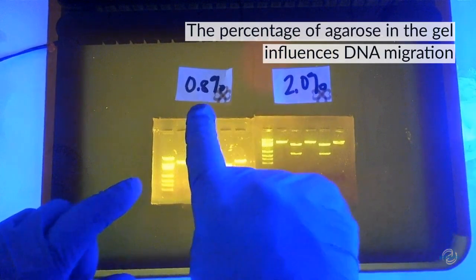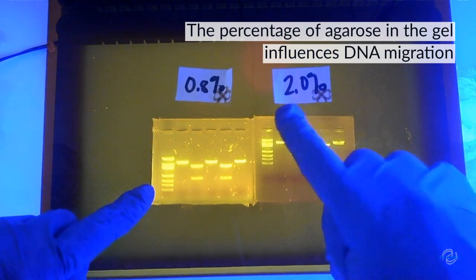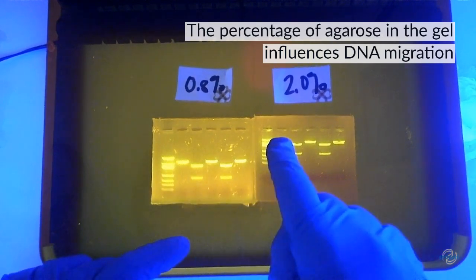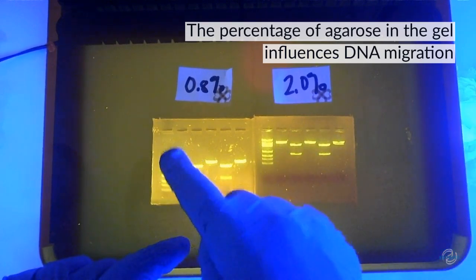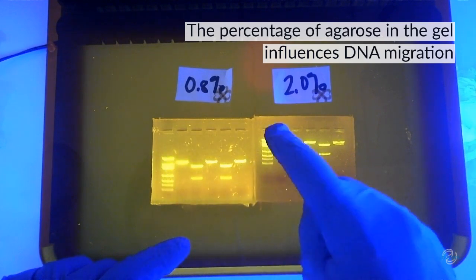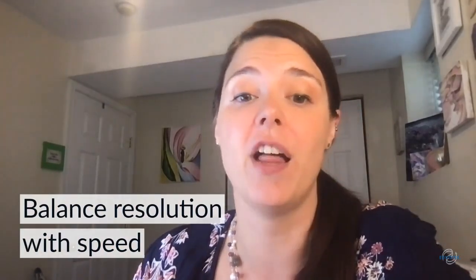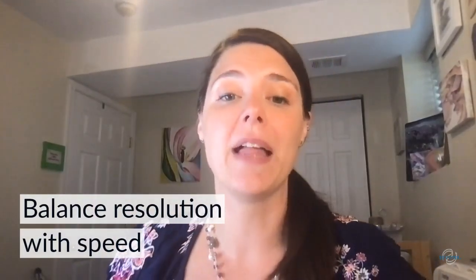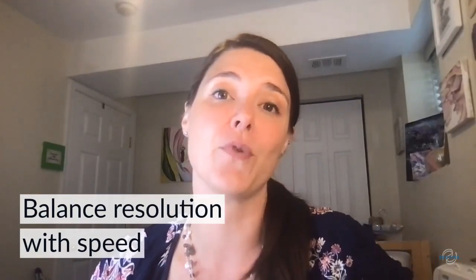Analyzing the migration of our DNA through the 0.8% and 2% gels: starting with the ladder, we can see that the top band — the largest piece of DNA — is closer to the wells in the 2% gel. Bands of the same size moved further through the wells in the 0.8% gel, and samples with two DNA bands separated further from one another in the 0.8% gel. Looking at the gels as a whole, the bands are closer to the wells in the 2% gel than in the 0.8% gel. Through our experiment today, we showed that the percentage of agarose does affect the way DNA fragments run. We can still analyze results even if we use the wrong percentage gel, but for best results, balance the resolution — how well it separates specific DNA fragments — with the speed of the experiment.